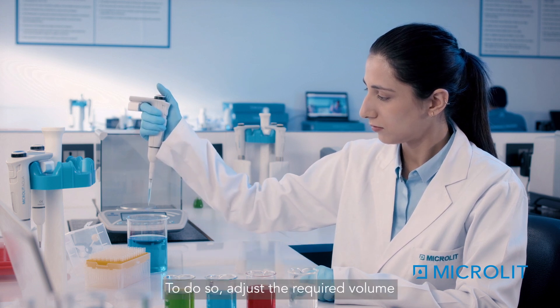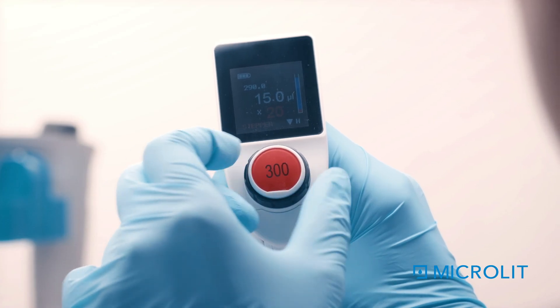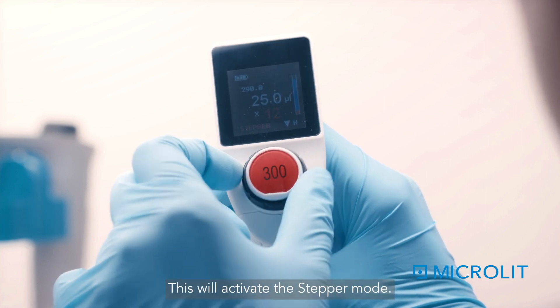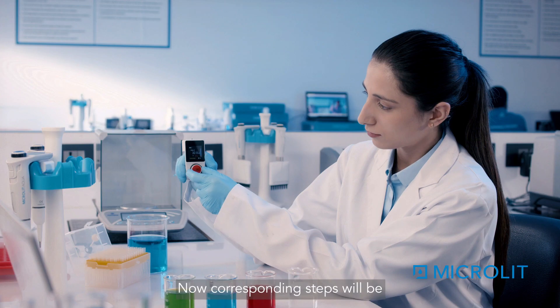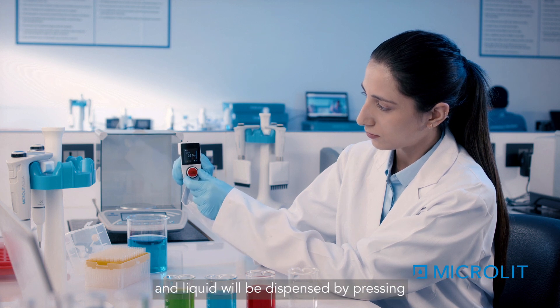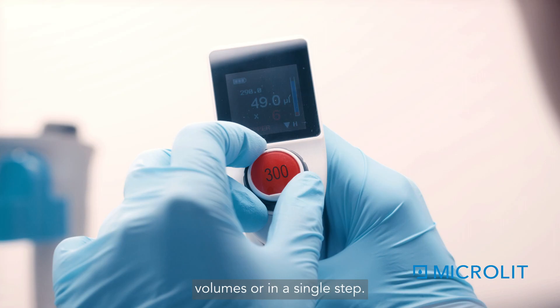To dispense a lesser amount, adjust the required volume using the volume adjustment wheel. This will activate the stepper mode — corresponding steps will be calculated as per your requirement, and the liquid will be dispensed by pressing the plunger button step by step in equal volumes, or in a single step.